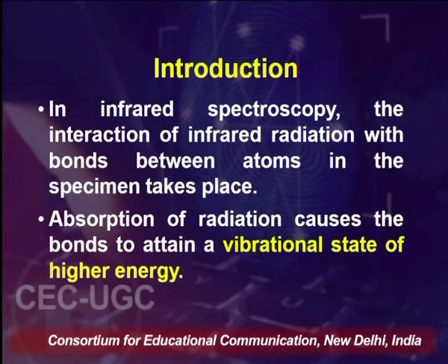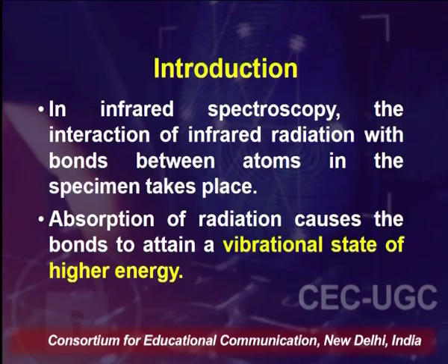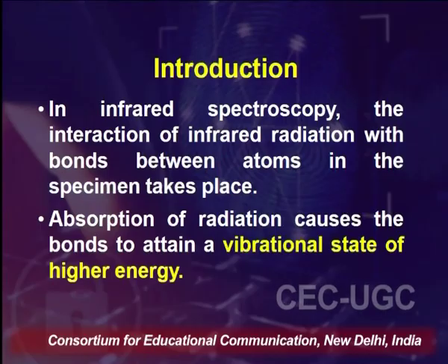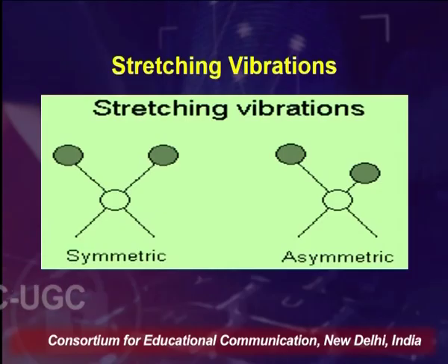As we said, infrared radiation interacts with the bonds between atoms in the specimen. The absorption of radiation causes the bonds to attain a vibrational state of higher energy. So, when the energy is taken up by the bonds in that particular molecule, there is a vibrational state because of the higher energy. There are two different types of vibrations which can occur.